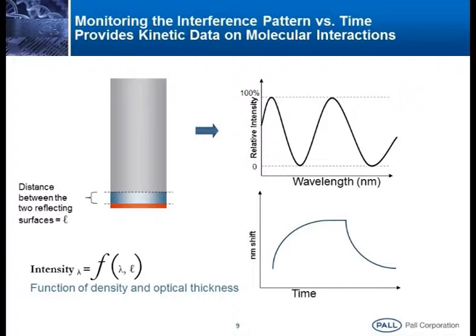There are equations to calculate the affinity, but label-free platforms are the only instruments which give the on rate and the off rate values. None of the other instruments give the on rate and the off rate. What is the on rate? The on rate is nothing but the association rate. The off rate is nothing but the dissociation rate. So, dissociation rate divided by association rate gives the affinity.